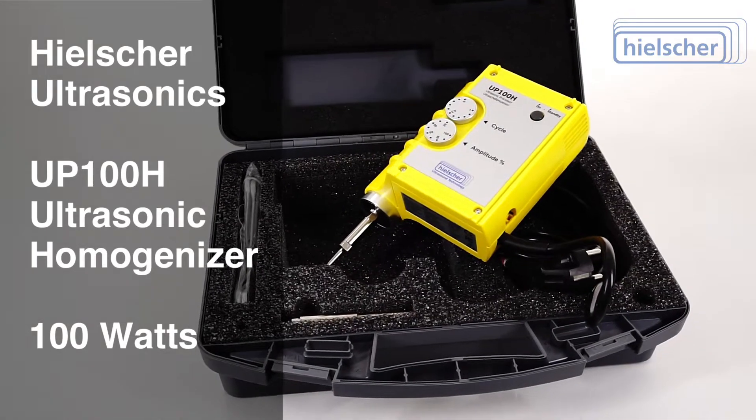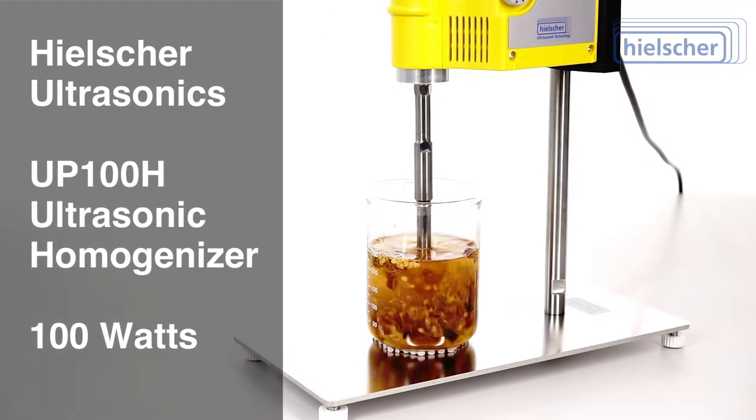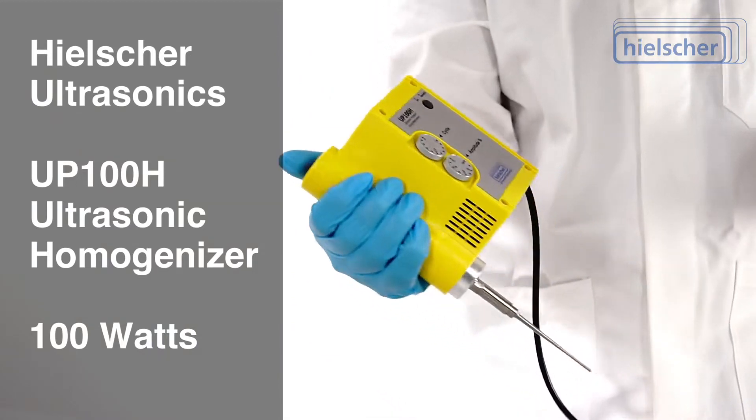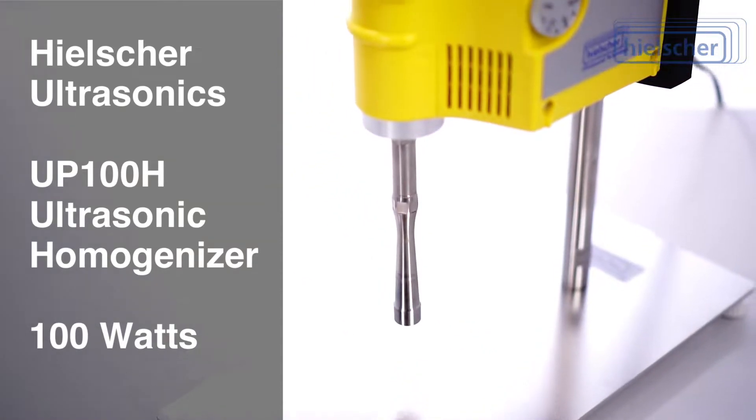This compact homogenizer comes fully assembled in a robust case. Plug it into the power outlet and you can homogenize your samples at the touch of a button — it couldn't be easier. The lightweight UP100H is comfortable to hold and can also be operated on a stand.